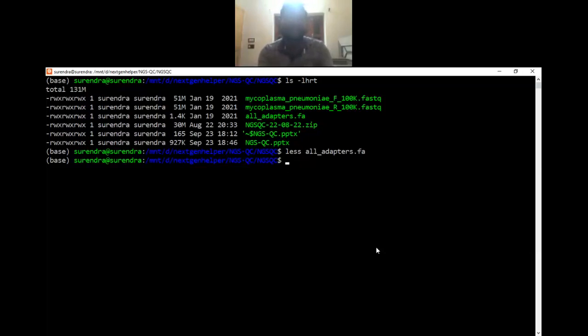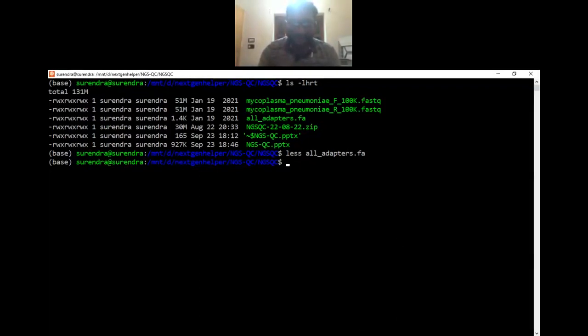Like you have numpy version something and the other tool requires numpy of some other version. So that is the best thing you can do here. Inside Anaconda, you create the environments and install the tools for each of them separately, and they will never clash. You can also do the virtual environment thing in Python the same way to avoid those dependency errors.